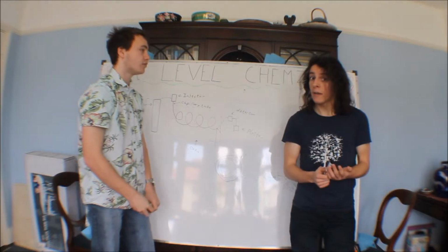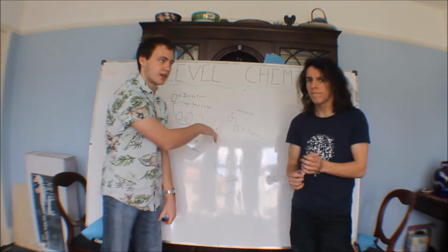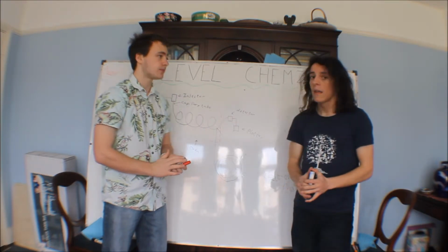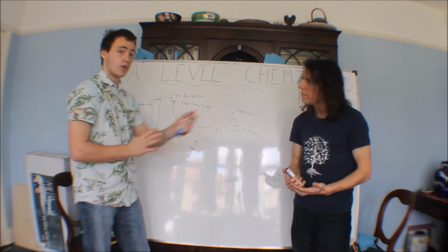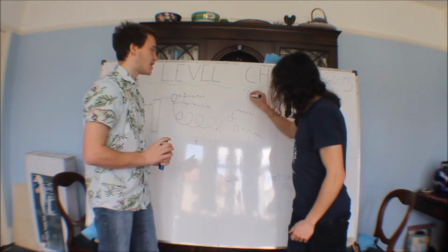However, it could be a liquid, in which case it's going to dissolve as it travels through here. Different things are going to dissolve by different amounts, to give different times. Now, what do you do with these times, William? Well, firstly, they're called the retention times. That's an important thing, a marking point. Retention.